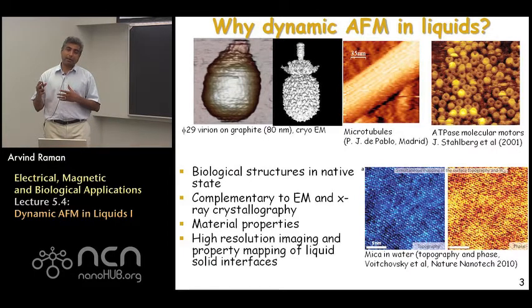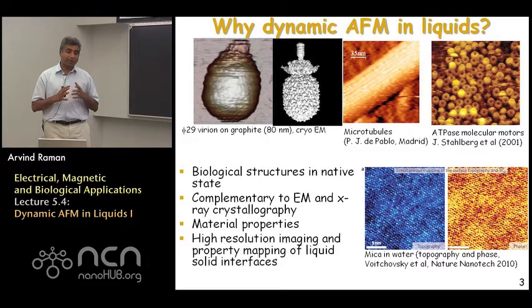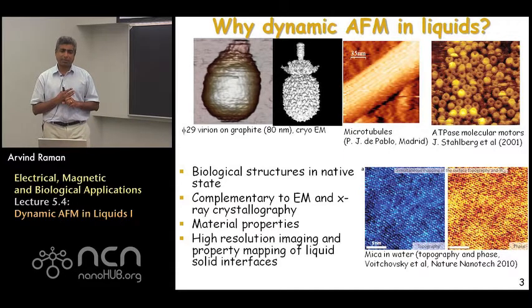And you can tell that there are a couple of interesting differences. The atomic force microscope is able to make out many of the capsid units, the little spherical bumps that you can see on the topography of the sample. But it's not able to make them out to as high a resolution as what electron microscopy suggests, which, when you think about why that is so, the reason becomes somewhat clearer. It has to do with the fact that in atomic force microscopy, you've got a tip, and the tip is going to deconvolve the sharp features of the image a little bit. So you can always expect, first of all, that in atomic force microscopy images, features will be broadened a little bit because of this convolution effect.